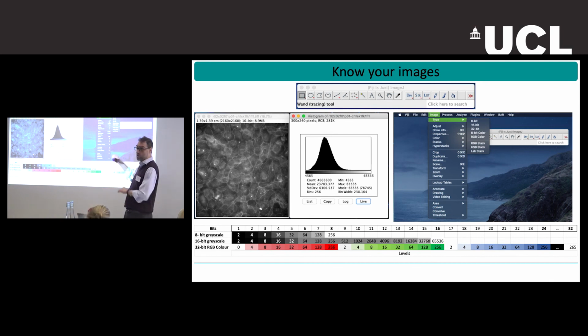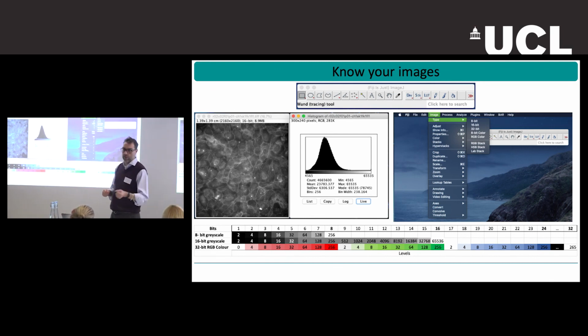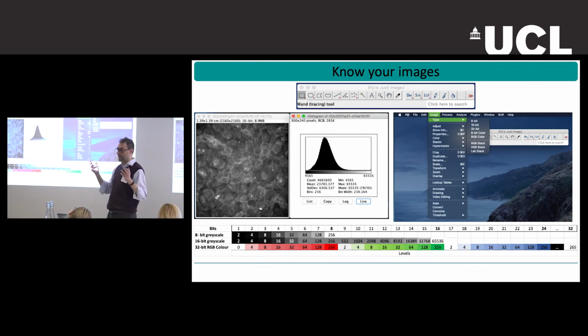For the nuclei, it works perfectly. For a proliferation marker like BrdU, EdU, or Ki67 with various protocols, these are very clear signals: either the cell is on or the cell is off. This is easy to do, and these are the kind of things where Columbus and Harmony make your life extremely easier out of the box. When you have a more complicated question, we can still use this software, but we have to put a little more thought into it.